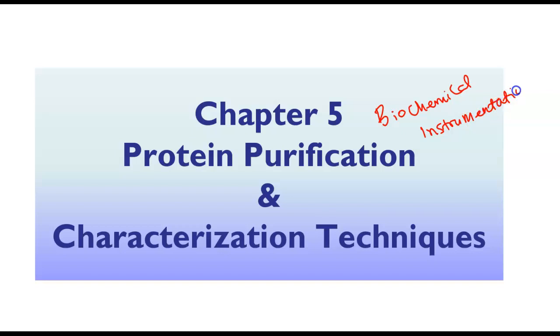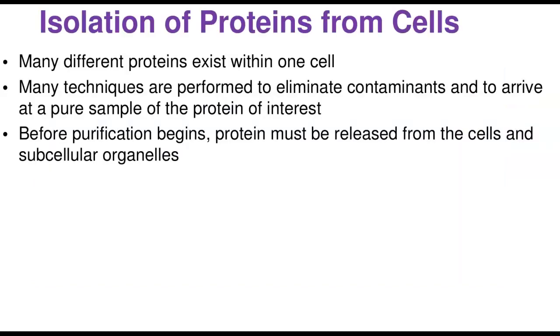So anyway, the topic according to the book we're using is just called protein purification and characterization techniques. That is exactly what we're going to be looking at. So we're going to take a snapshot of those methods and techniques used in extracting protein, purifying protein, and then characterizing them. And let's take it off from there.